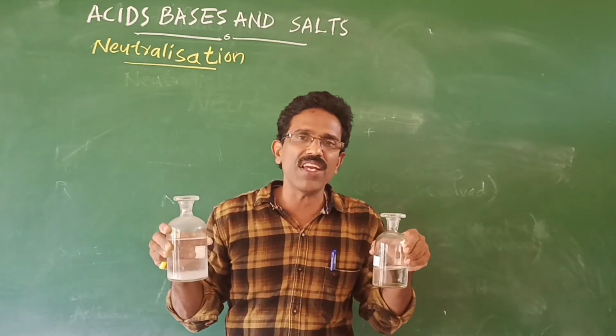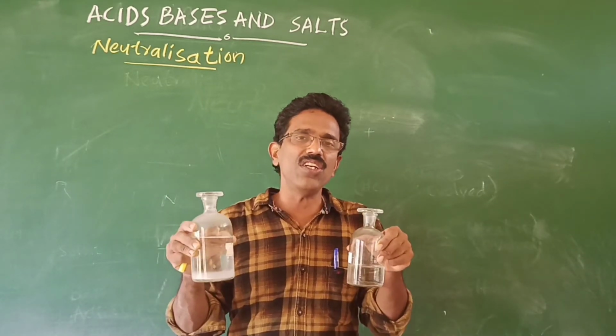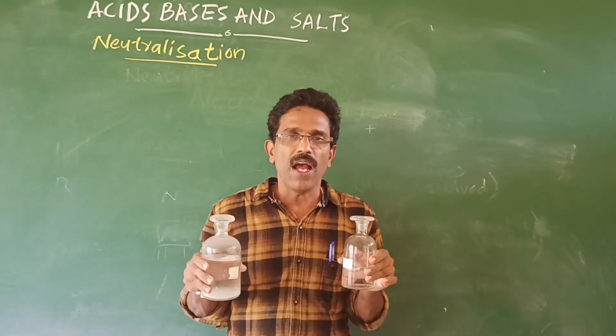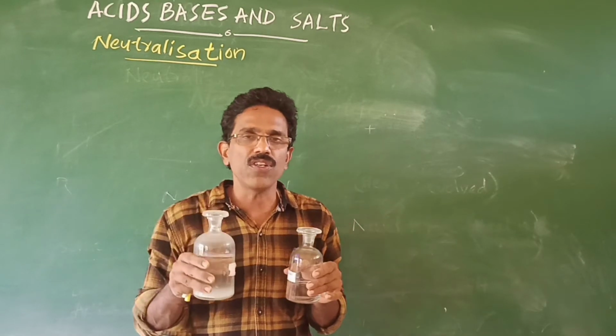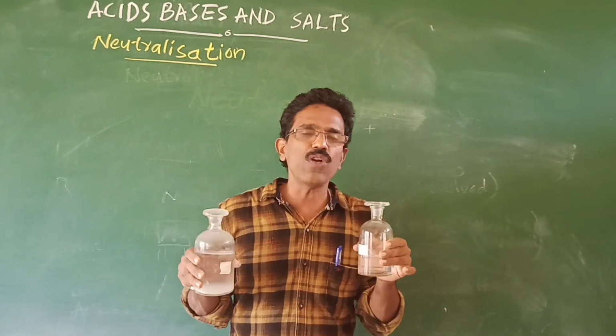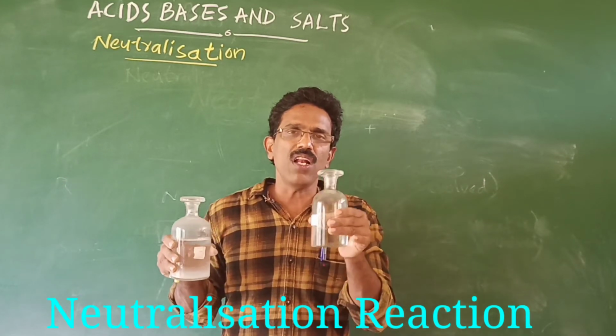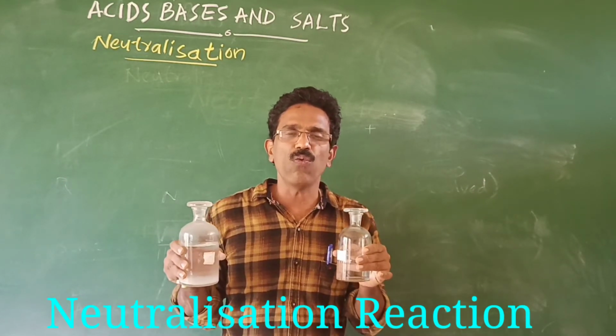During this chemical reaction, heat energy is evolved, or released. If we touch the test tube soon after the neutralization reaction, you can feel the test tube hot. Why?